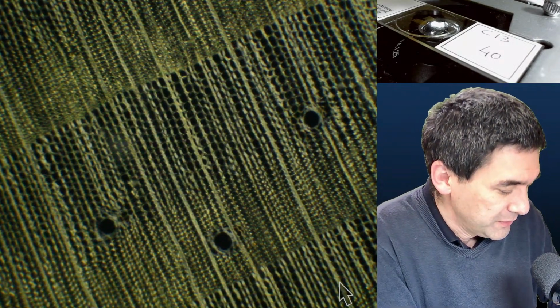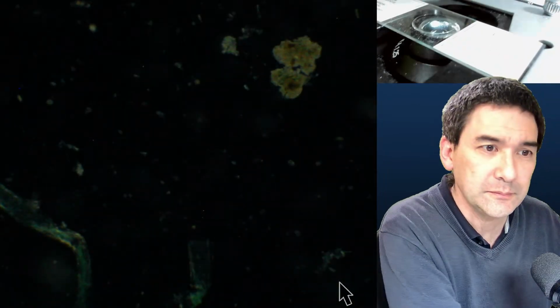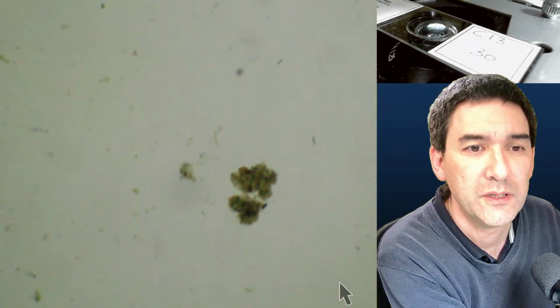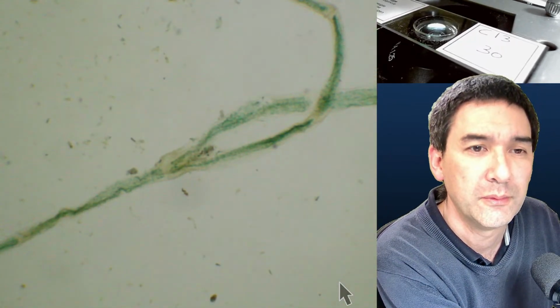So I want to show you some other stuff here. That is a permanent mount of an algae. So let me change this here. Let me use just regular bright field. It's just some algae that were prepared.